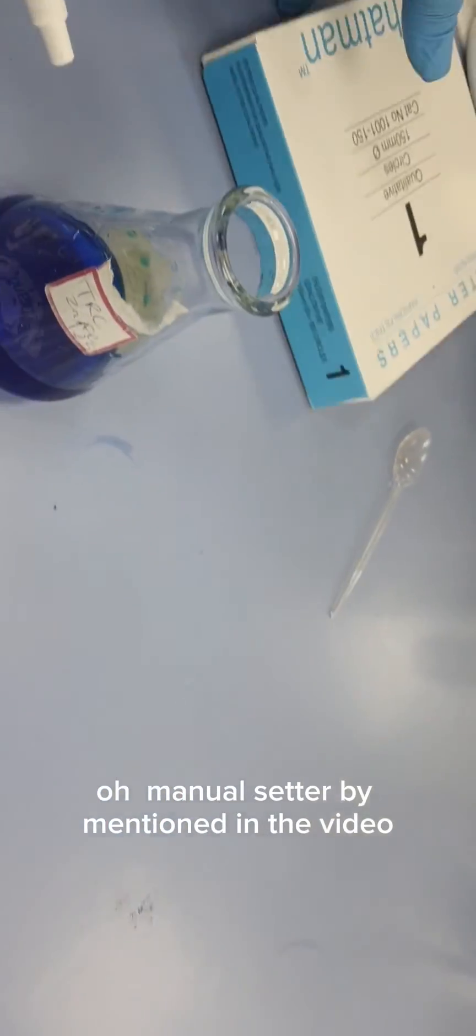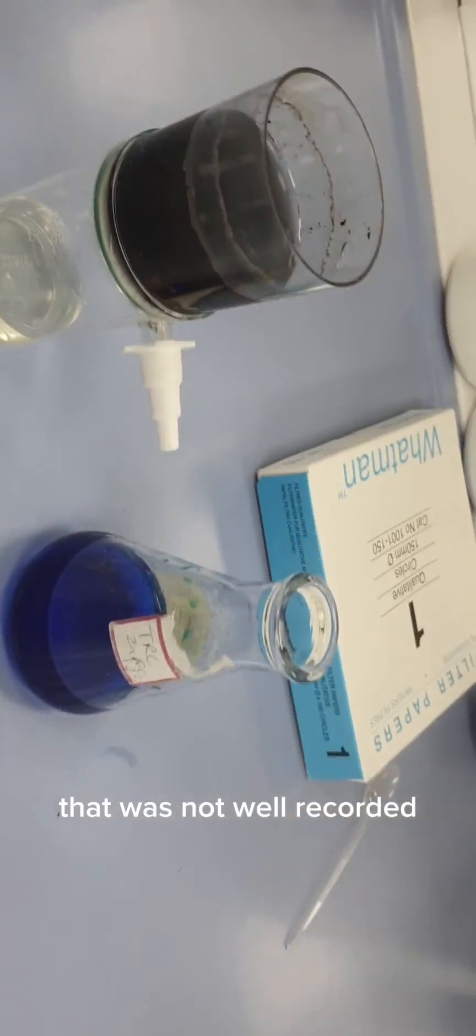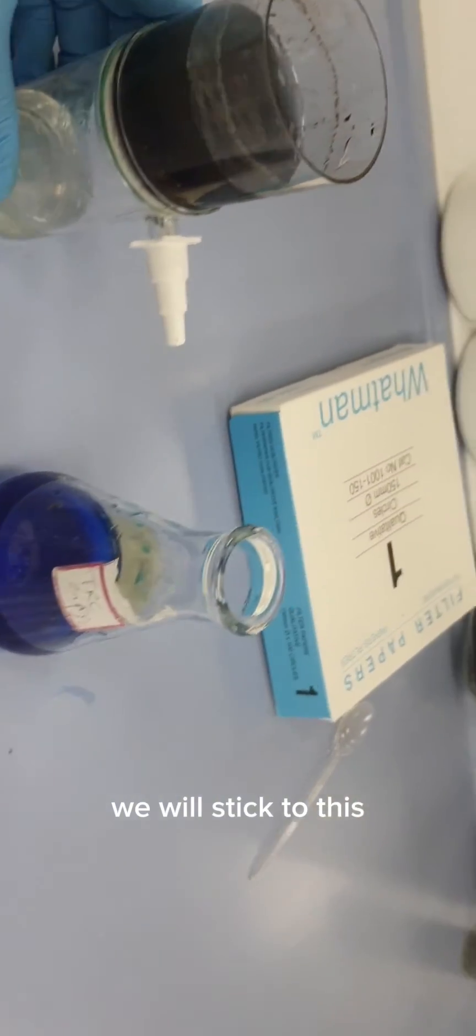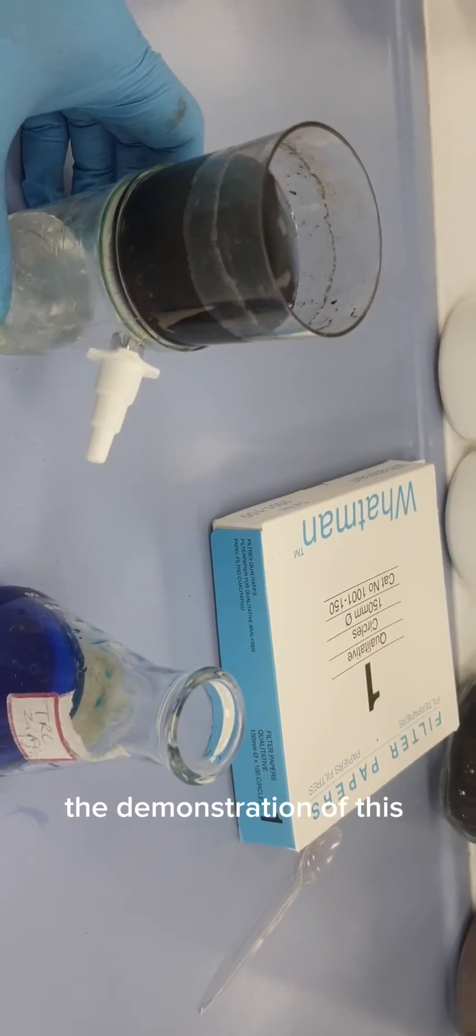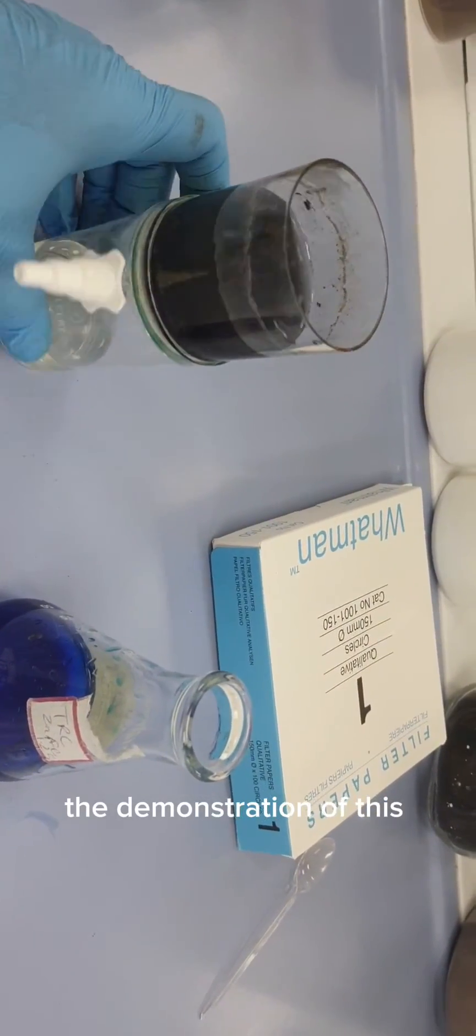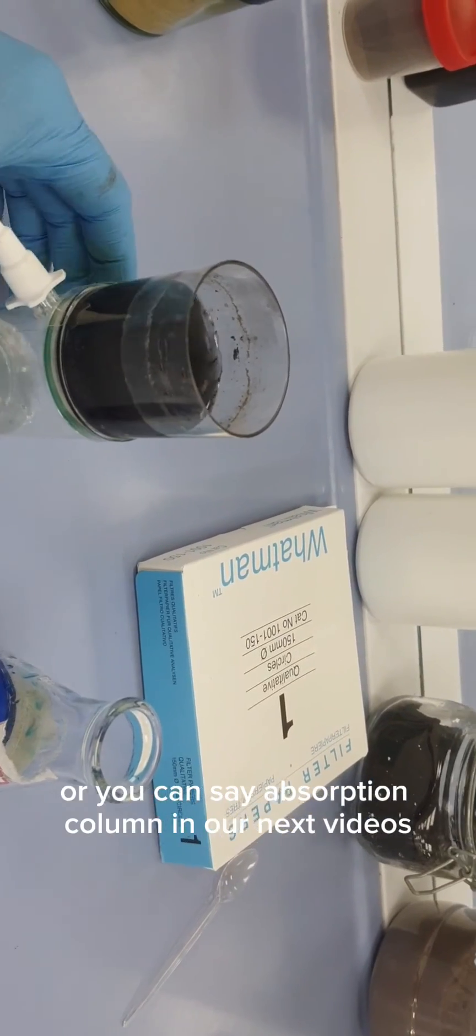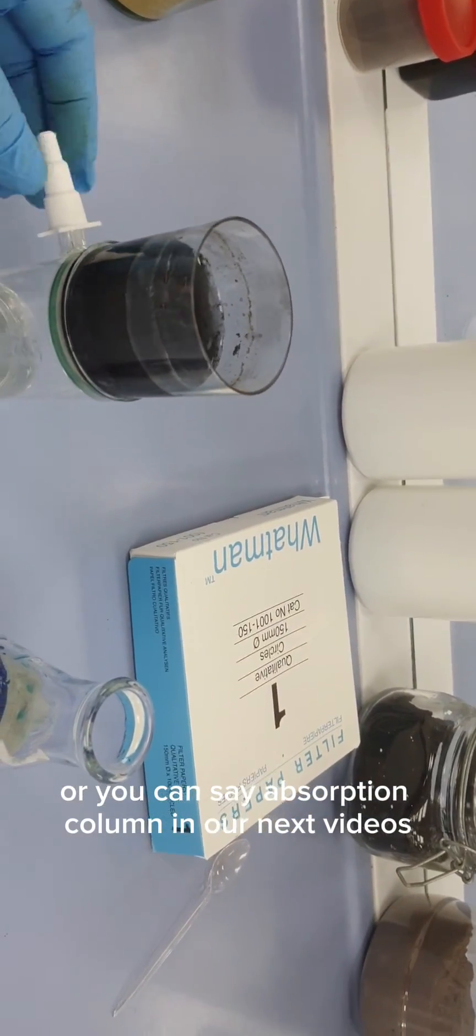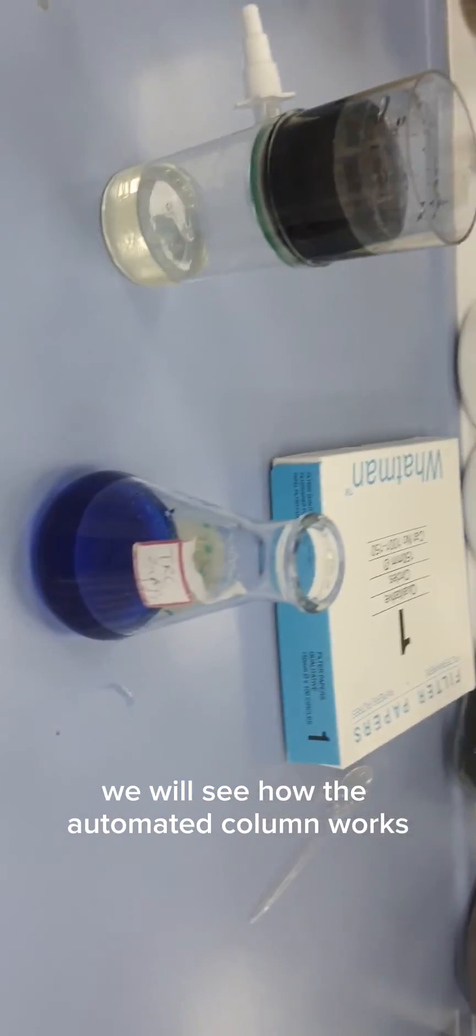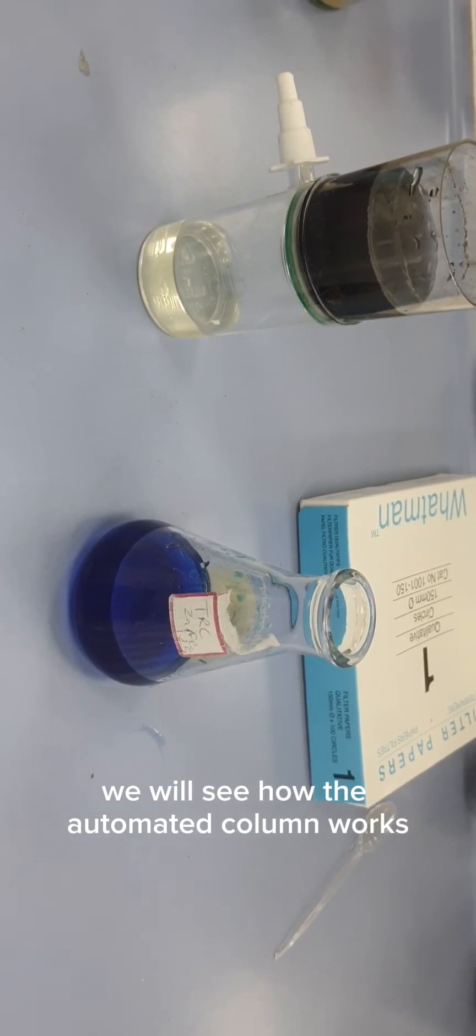Forgot to tell you that the old or manual setup I mentioned in the video was not well recorded, so we will stick to this and to the demonstration of this manual or adsorption column.